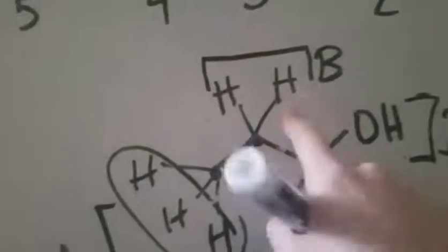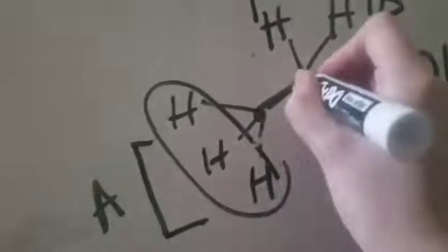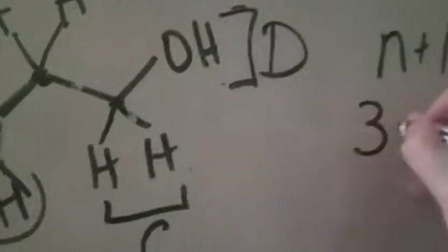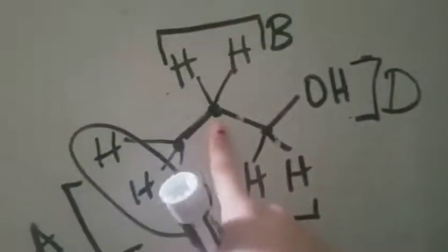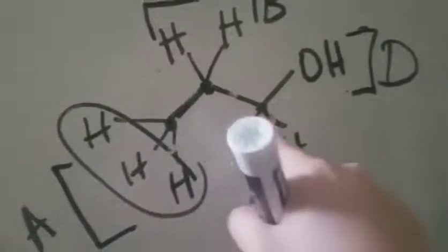So I have CH2. Let's see, what is this one connected to? So if I look at this neighbor, hold on, I'm going to erase this. Okay, so for this one here, I'm going to look at this neighbor here. So it has 3 connected to it. So that's 3 for the neighbor. Is it connected to anything else? Yes, right? So that means I have to also account for this one. I count for both of which they're connected to.